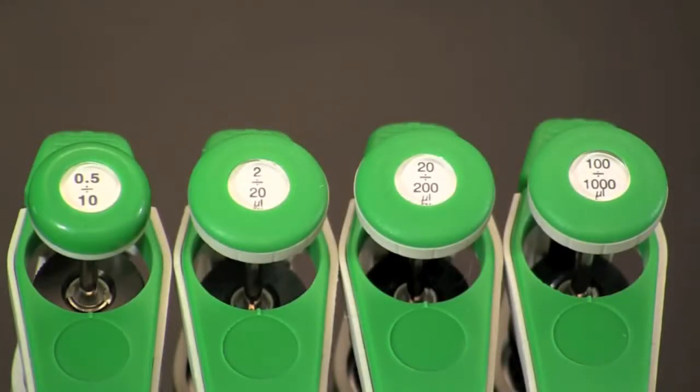The volume range for a micropipette can be found on the top of the plunger button. The most commonly used ranges for micropipettes include the 0.5 to 10 microliter, the 2 to 20 microliter, the 20 to 200 microliter, and the 100 to 1000 microliter. In each case the two numbers indicate the range between which the pipette can measure with accuracy.